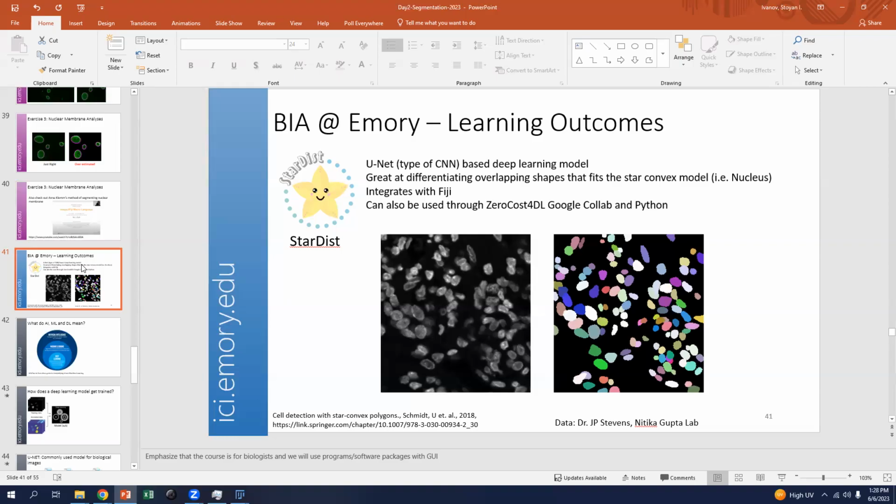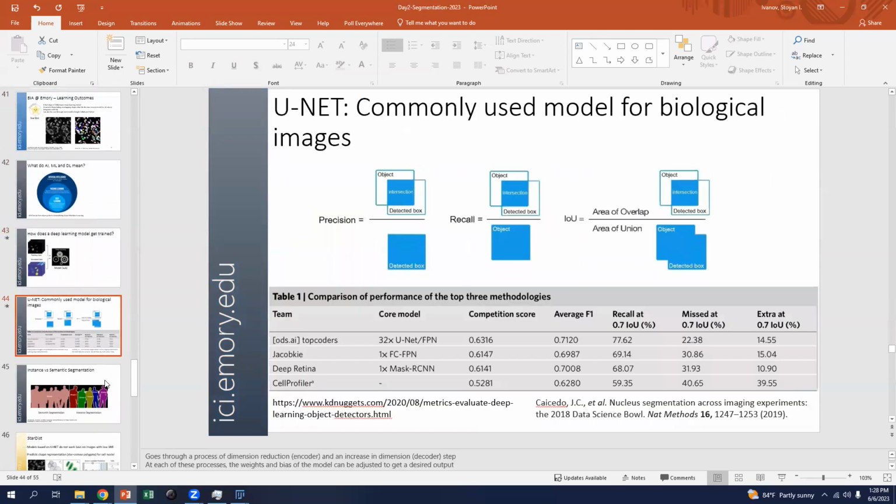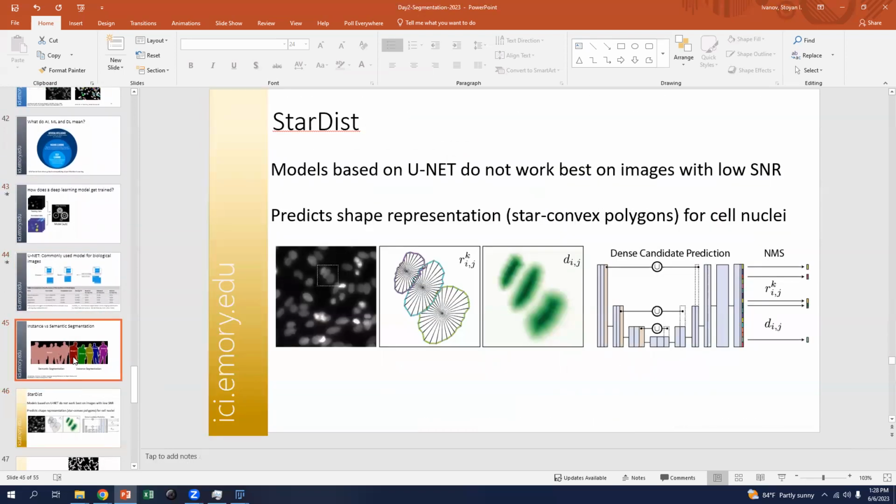So what is the point of that story? Just to say that if you have a badly labeled image, you're going to have a bad output. And a machine learning algorithm isn't necessarily better than a human operator, especially at the edges of applicability. We'll skip this. I can go over more of it tomorrow.